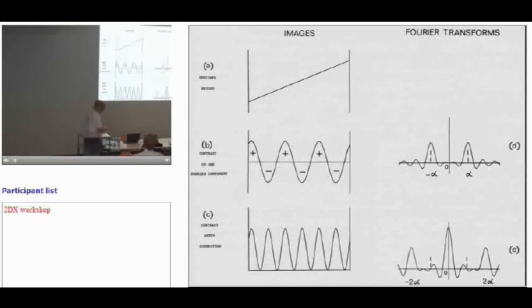And another way of thinking of that is that you've tilted your crystal, and the 2 diffraction spots come out, and they've been moved slightly because of the intersection of the reciprocal lattice with the Ewald sphere; the geometry moves them slightly. It's exactly the same thing that's happening, but they're 2 different theoretical ways of following through what's happening. This way is a convolution way, where you get it split.